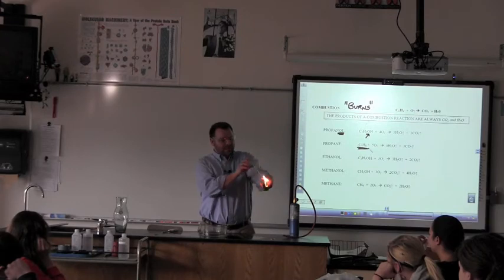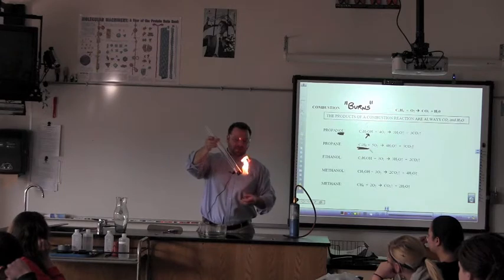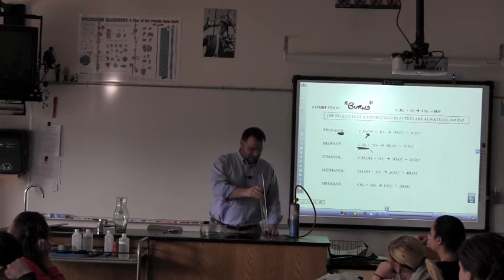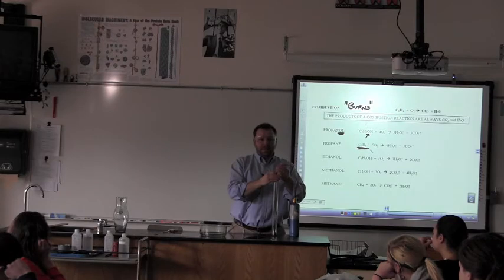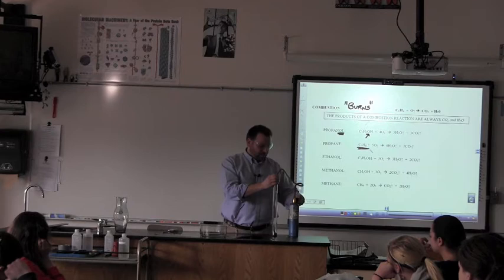So this is where the oxygen is coming out of. Notice it's not going up into the tube because there's really no oxygen there. And so that's a pretty simple kind of thing to see. We definitely need oxygen for combustion to happen. But again, like in an engineering situation, I can also control the rate at which this is reacting with oxygen. Now that's just reacting with oxygen on the outside. You can smell the rubber, can't you? Yeah, that's just the burn of the rubber stopper.